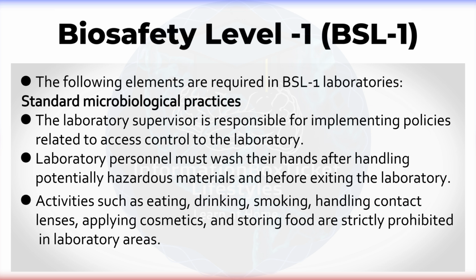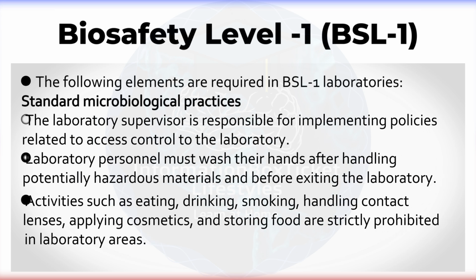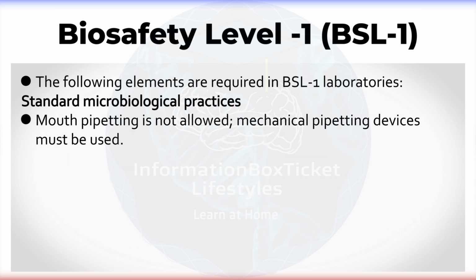Activities such as eating, drinking, smoking, handling contact lenses, applying cosmetics, and storing food are strictly prohibited in laboratory areas. Mouth pipetting is not allowed. Mechanical pipetting devices must be used.